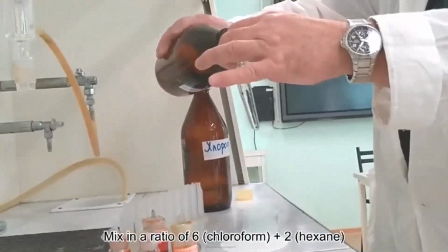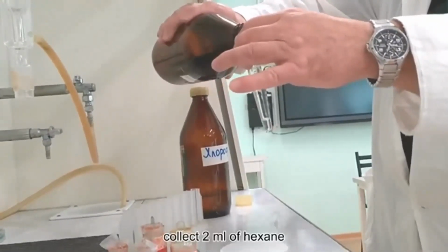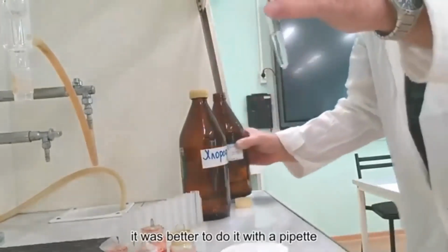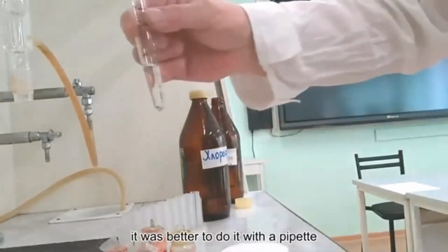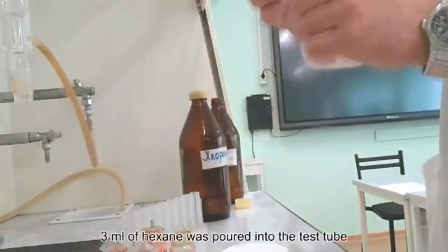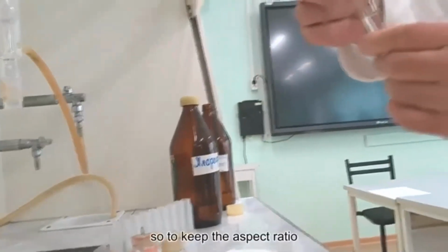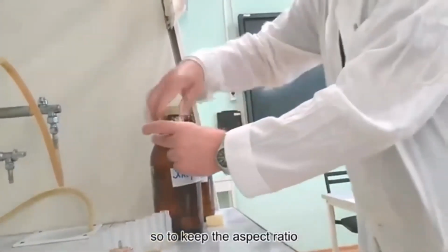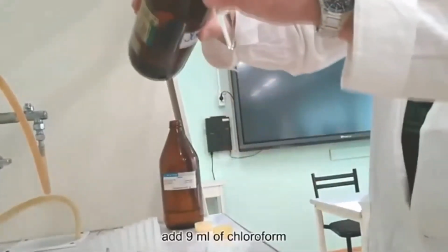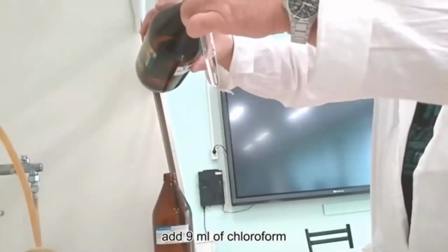Снова. Это довольно сложно. Конечно, лучше бы это пипеткой делать. По-человечески, а не так. Я уже, к сожалению, тут налил 3, поэтому 3 части. Надо еще 9 добавить, да? Значит, это я добавляю 6, 7 и еще потом 2. Вот так. Потому что 3 есть. Еще сделаем. Сейчас.